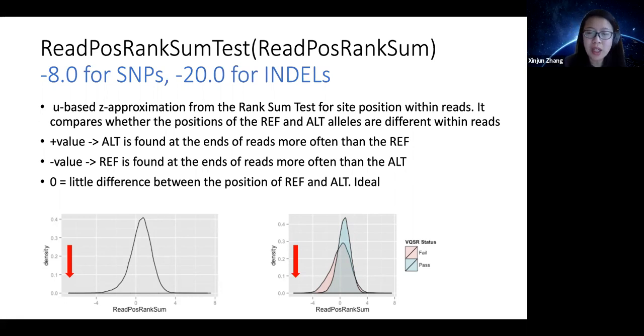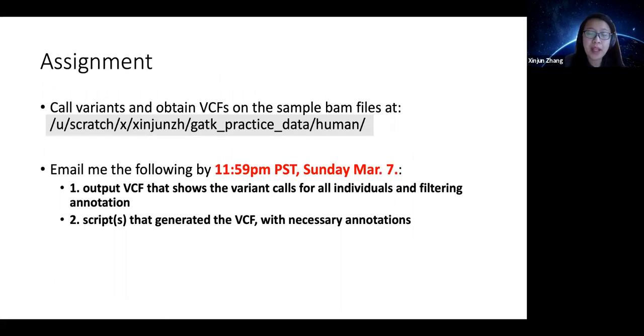Either way should work. What I want you to do after this workshop is to get a VCF that is called correctly on a set of individuals, and is filtered depending on which filtering method you used.